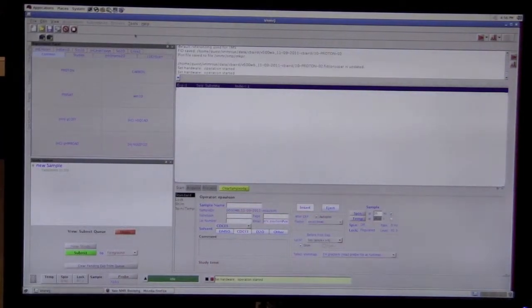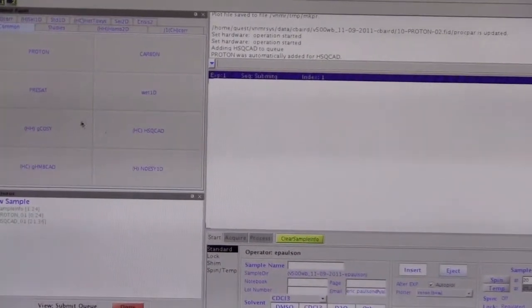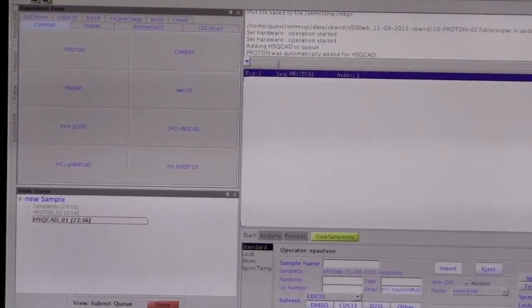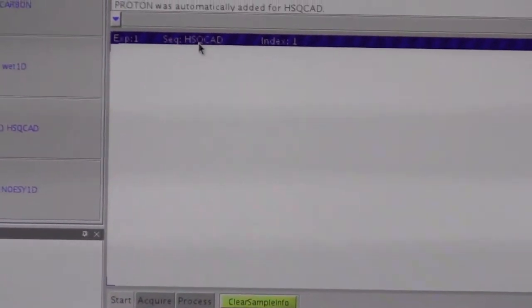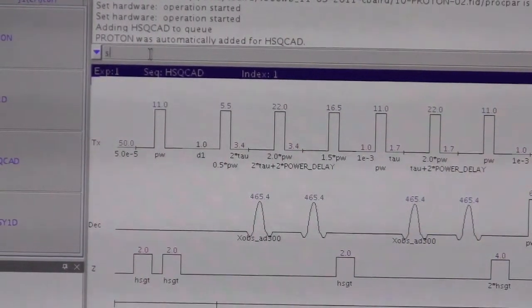The next thing you want to do is load an experiment. We'll do the HSQC — click on it and double-click the HSQC. Once it has updated so that the experiment is the HSQC, go to the command line and type SU.